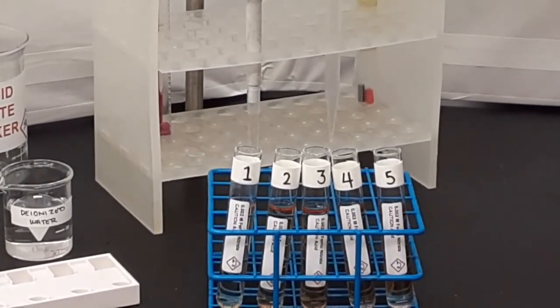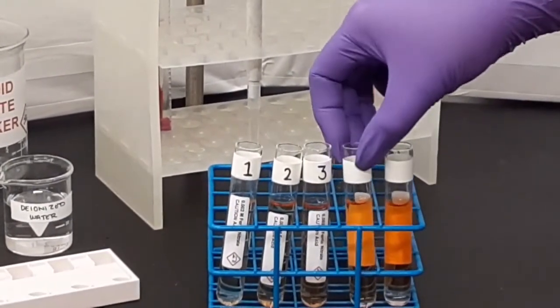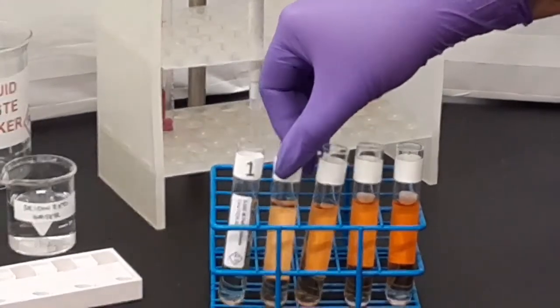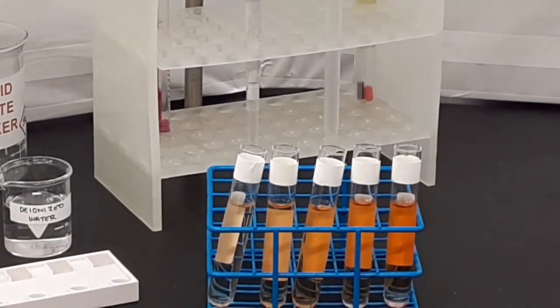Now we'll turn the tubes around. Notice we already have strong color development. We have a gradient. And all of the tubes have approximately the same amount of liquid in them. This was a successful operation.